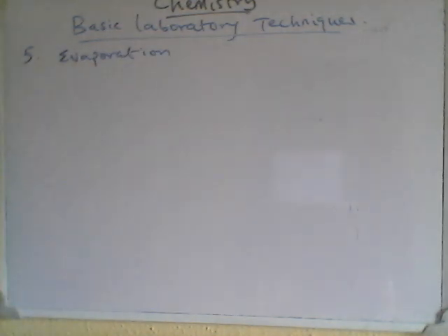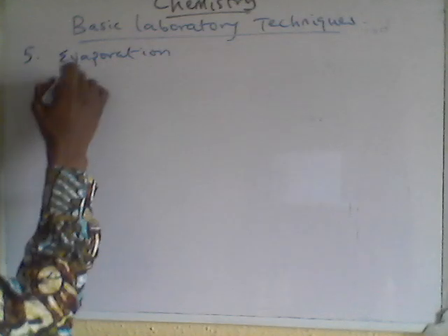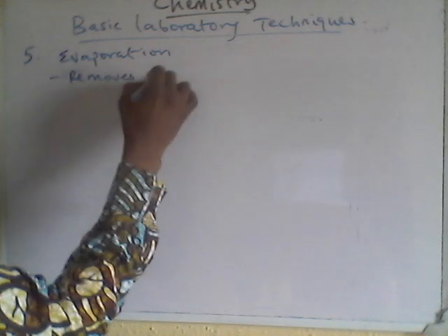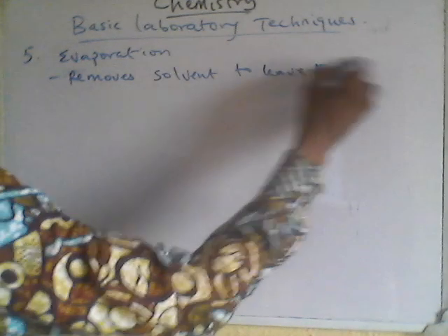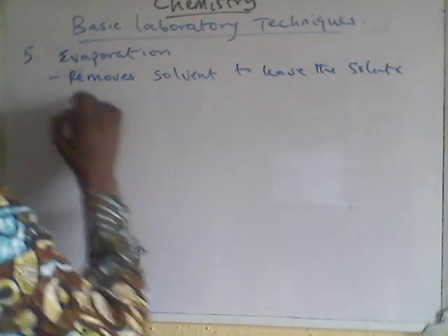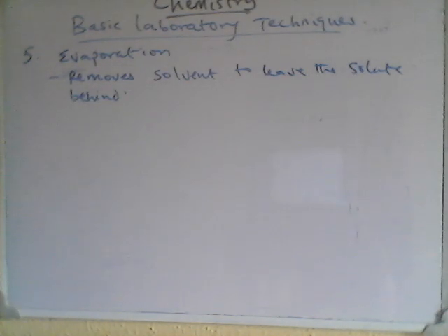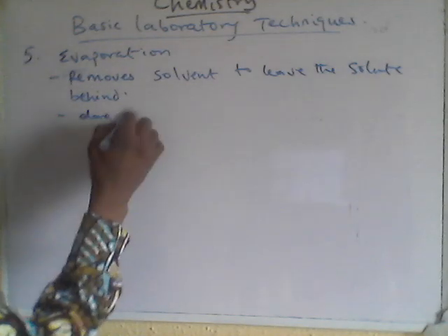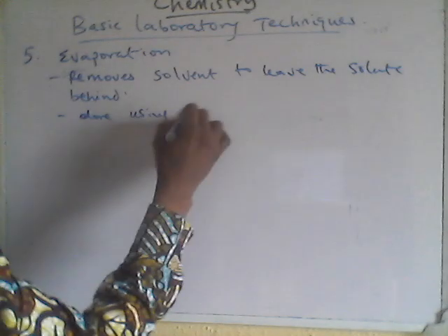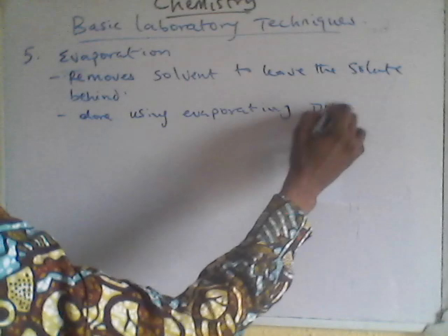So this one involves removing solvent to leave solute behind. Remove the solvent, that's the liquid, to leave the solutes behind. It is done under high temperature, using an evaporating dish.